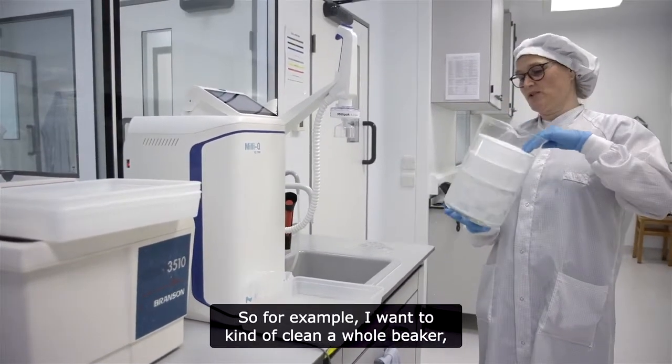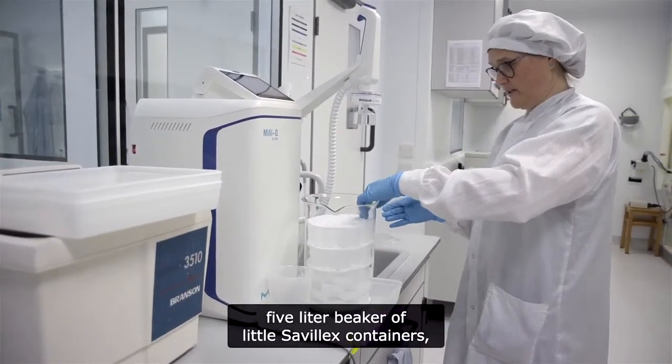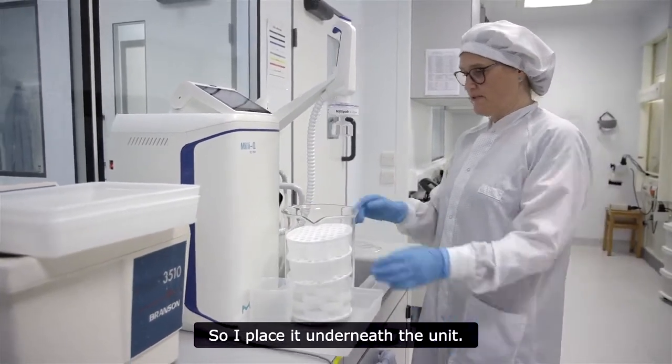For example, if I want to clean a whole beaker — a five-litre beaker of Savillex containers or Teflon containers — I place it underneath the unit.